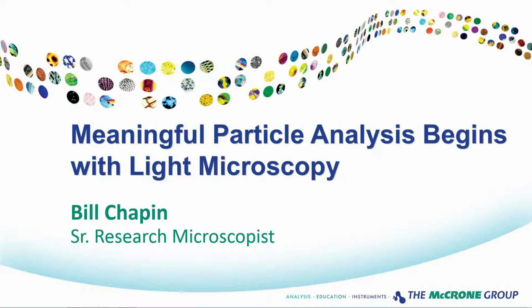Bill is going to talk to us about meaningful particle analysis and how it all begins with the light microscope, in particular, the use of the stereomicroscope.